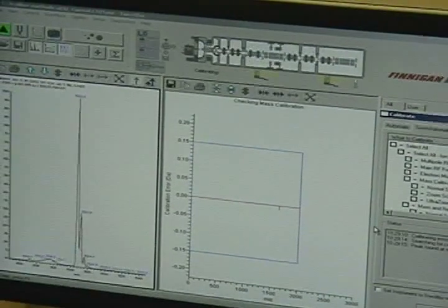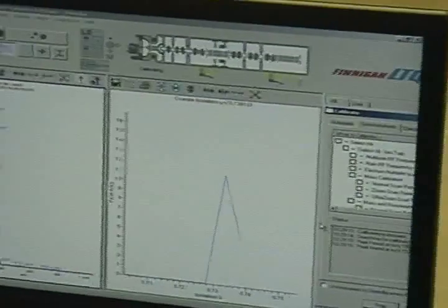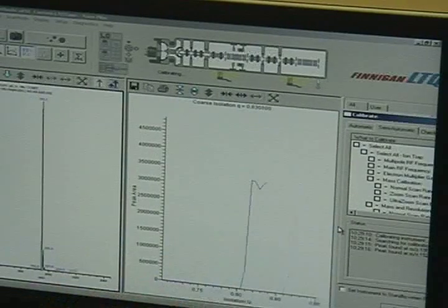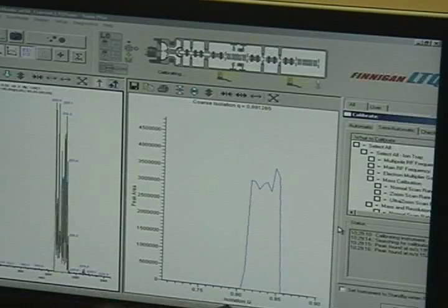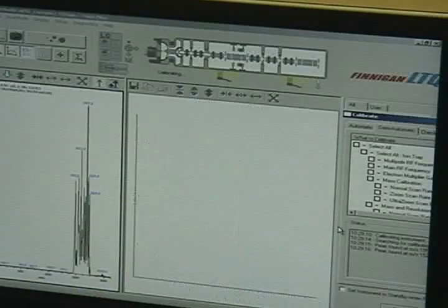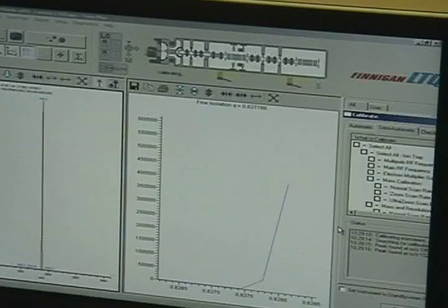Right now we assume the Q value plot was correct. Now we're going to actually measure those frequencies and make sure they're correct, and if they're off, we're going to adjust them. So isolation and activation are all about the frequencies. We're looking at a mass, and we're adjusting the Q value, and we're trying to find exactly where the mass is really sitting on that picture.